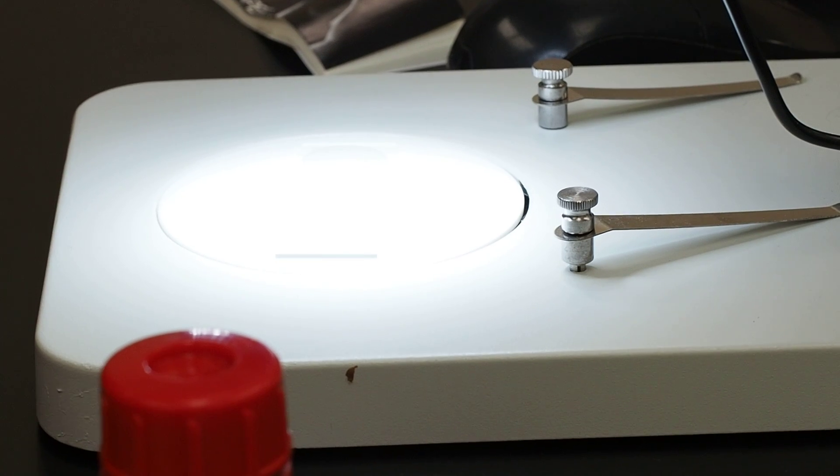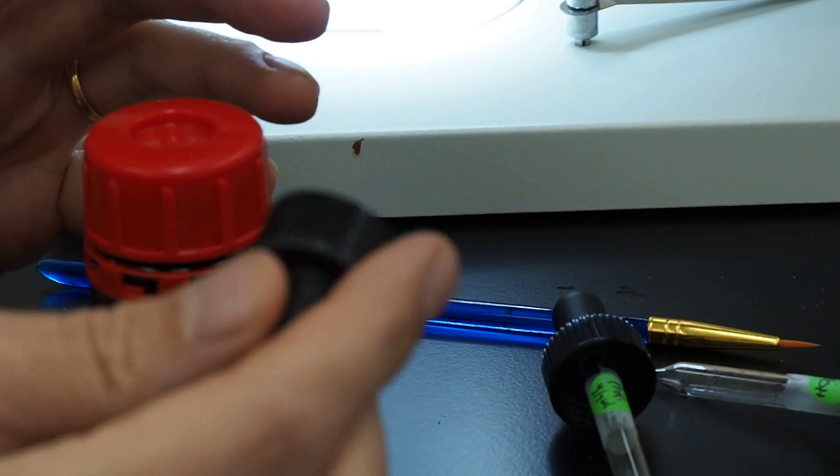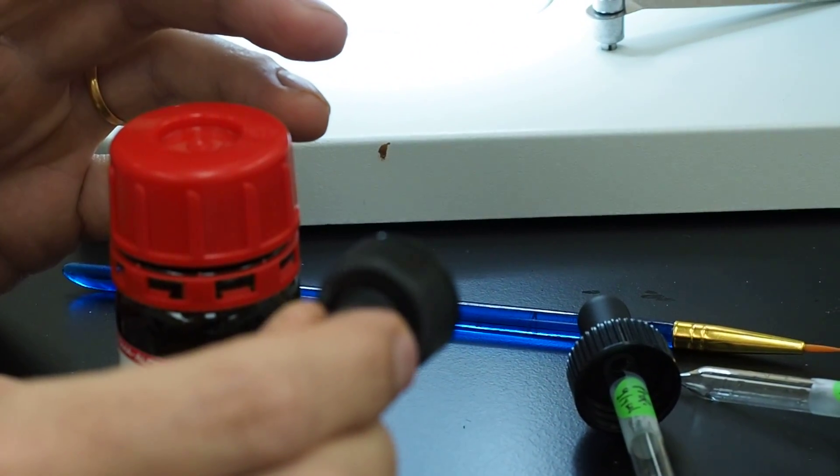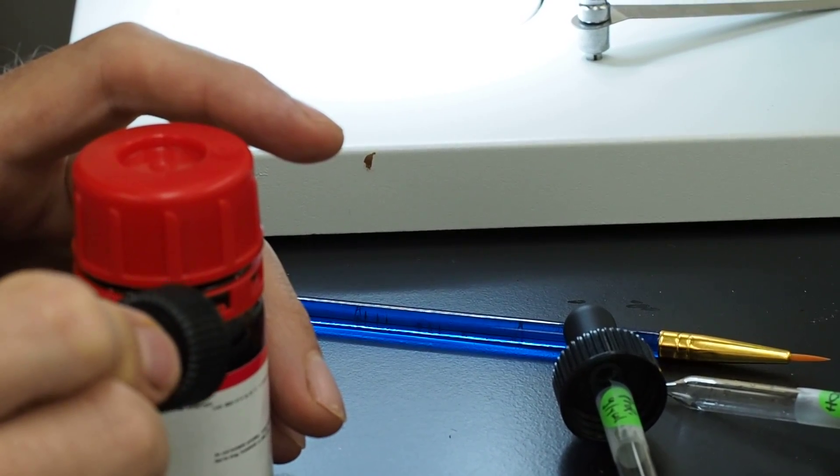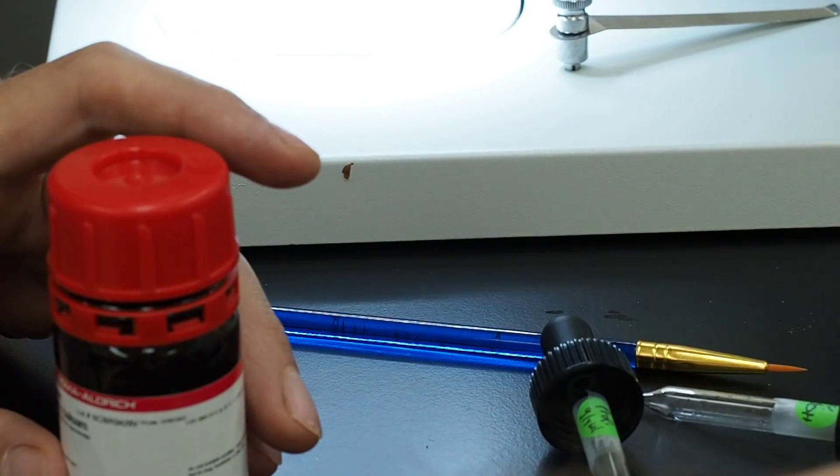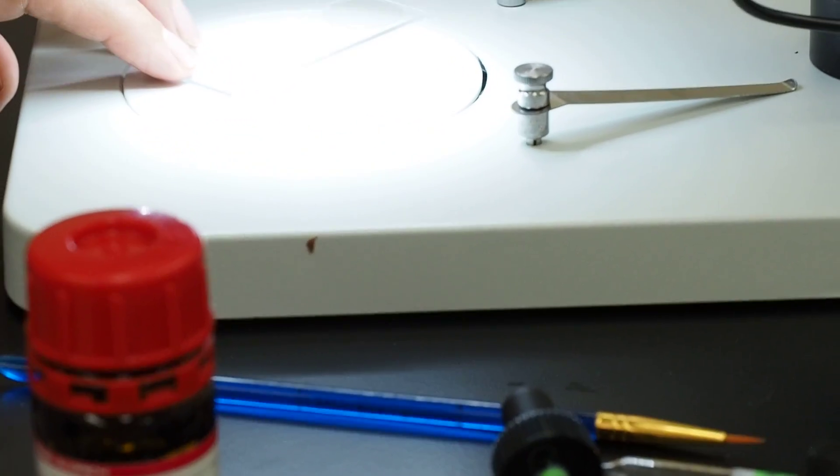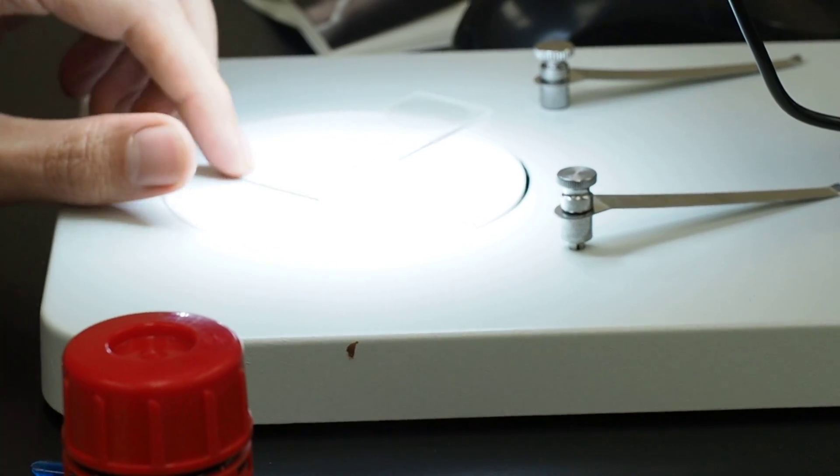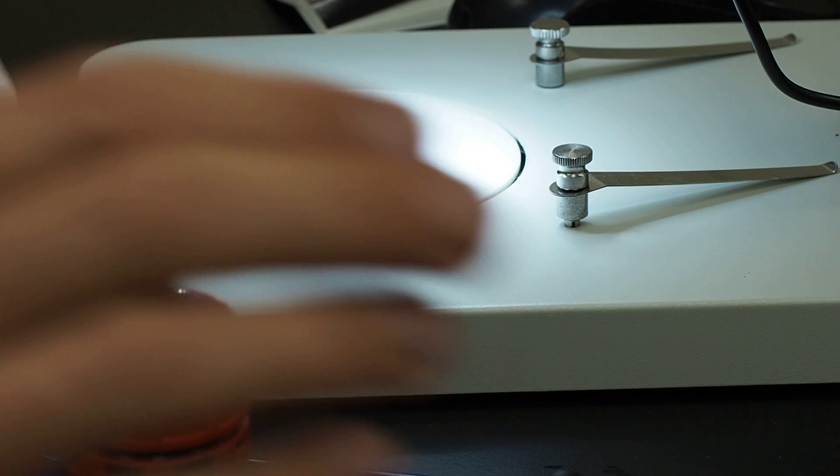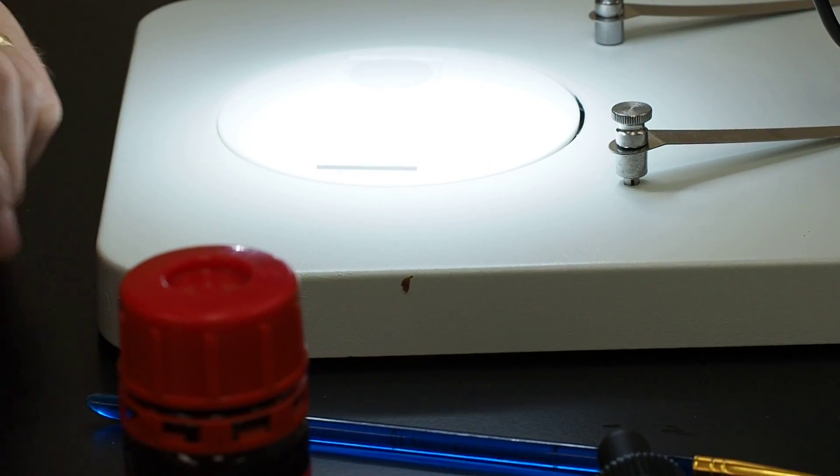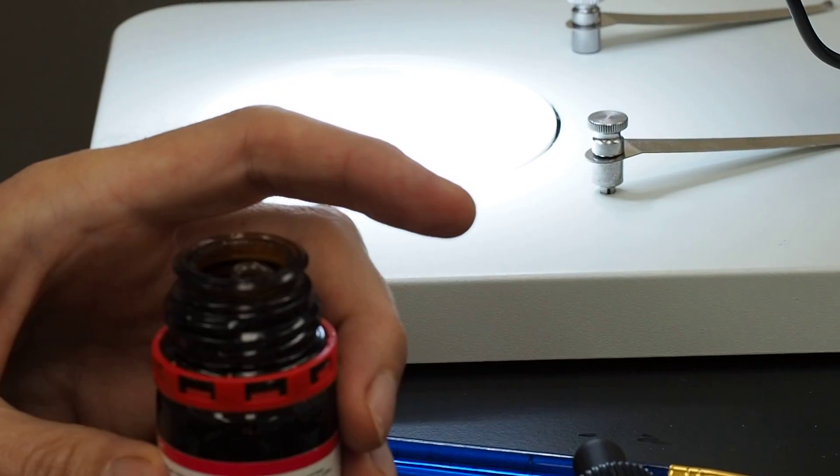So now I have our Canada balsam and I've taken one of the glass pipettes off of its bulb and put it inside there. So the next step then is we've got to put a droplet of Canada balsam on our microscope slide.